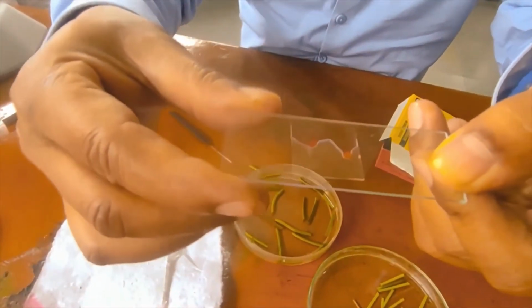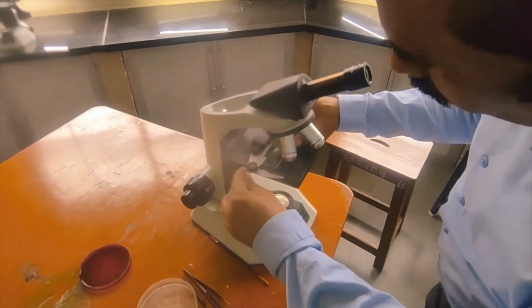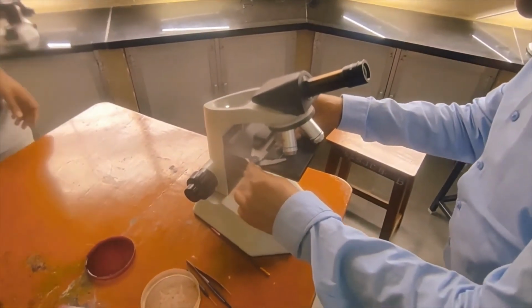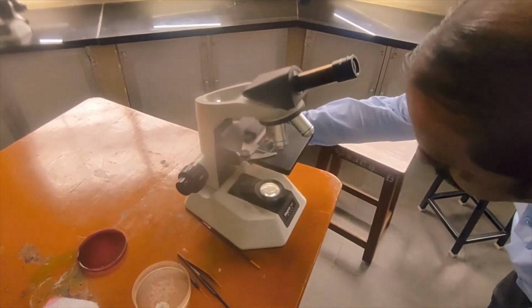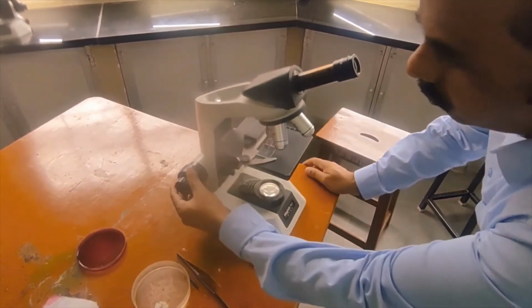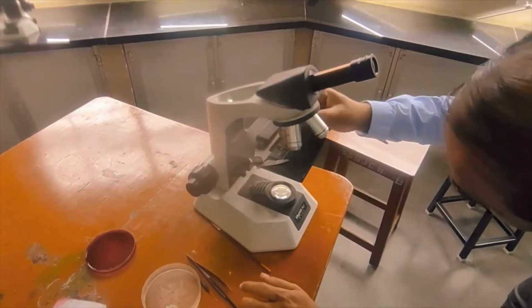So your section is ready. Now you can observe it under the microscope. This is the stage of the microscope on which you can keep the slide. Alright, I have kept it. Next, you select the low power, and move it up and down. You can move it up and down by using this knob. Okay, and you select the low power.